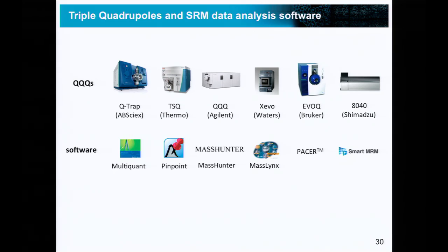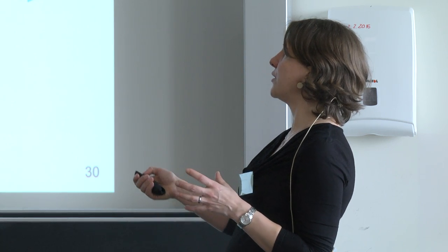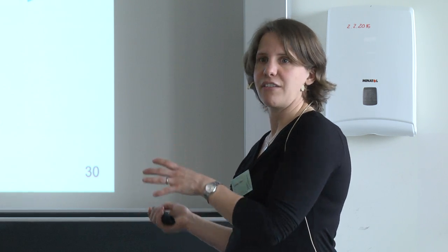And in the past, it actually has been literally impossible to directly compare data that came from different vendors, because you were never sure whether the differences that you see are really due to the measurement or whether they are due to the software processing afterwards.